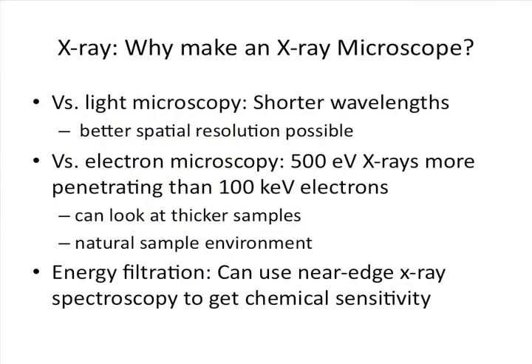And this other microscopy may be X-ray microscopy. It's a way to get shorter wavelengths than normal confocal or optical microscopy, because obviously cell biology is very much studied with optical microscopy, confocal microscopy. The single problem is that you don't have such a high resolution, but X-ray photons are really of a shorter wavelength than the normal light you use for vision.